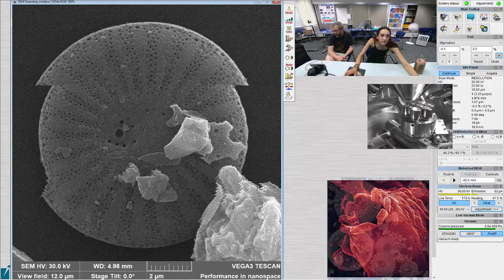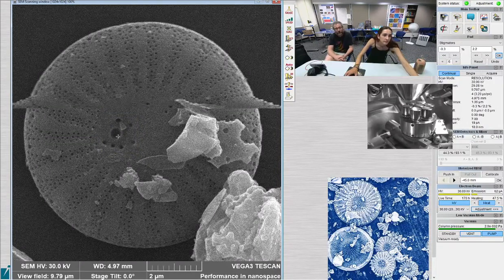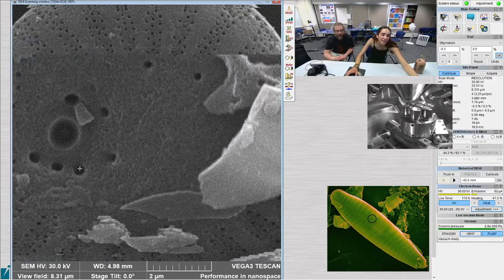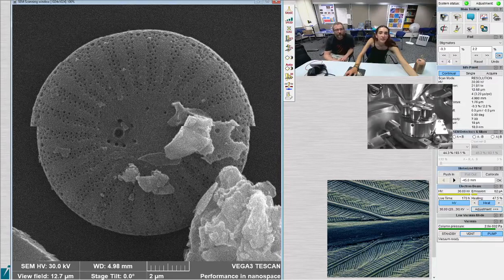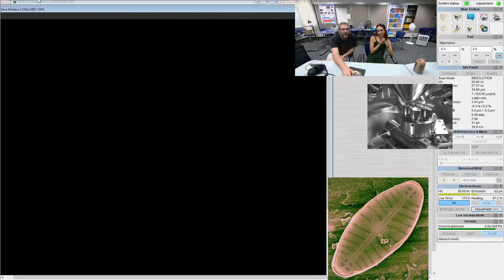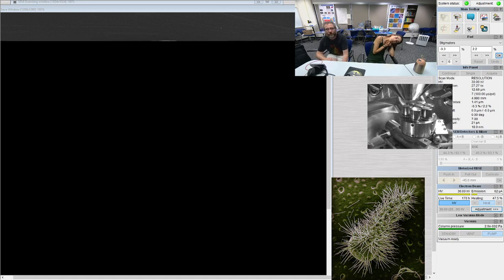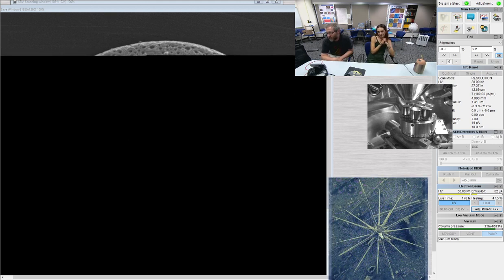What's the highest resolution in this microscope? We can actually ramp the resolution of the image up really quite high. I'll wait until Laura starts taking this picture, and then I will try to show you. That's better. Oh, I don't think you can see the menus, but I can read them to you. Perfect. Okay. If I go under SEM image parameters, right now it's saving the image at 1280 by 1280, but we have options all the way up to 16,384 by 16,384. That's the maximum resolution of the image.